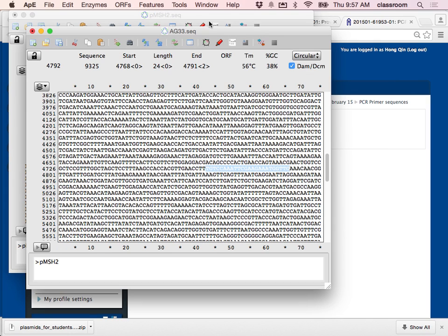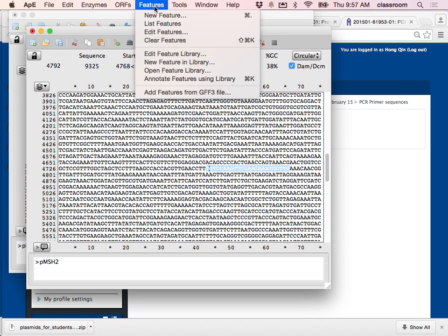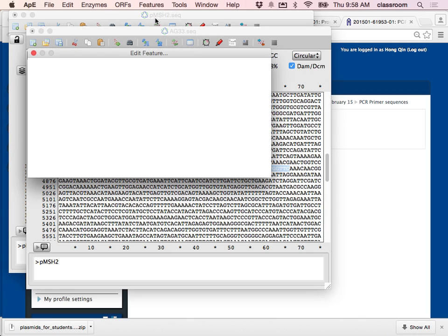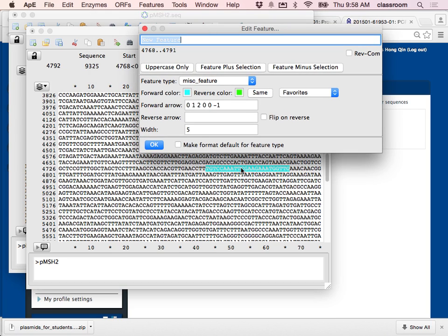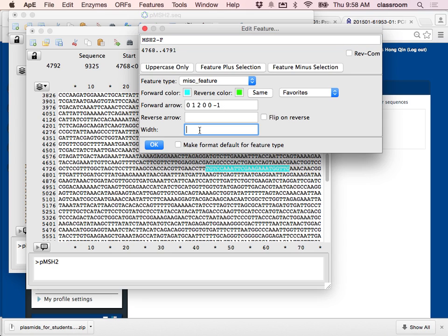I close this and go to the map, then Features, and click New Feature. At the bottom it's highlighted: TGTCCAA — make sure that's where the primer is going to be labeled. I label this as MSH2 forward F, sense direction, and make the primer arrow much larger by setting a value of 10.